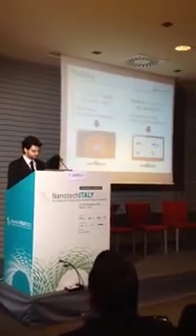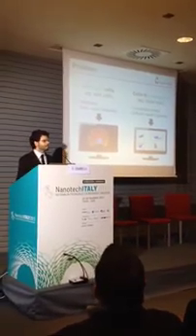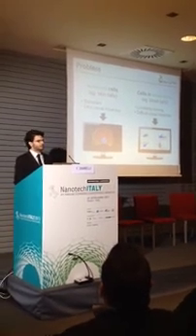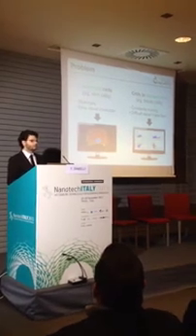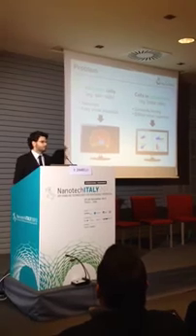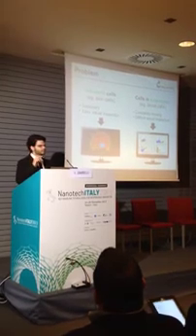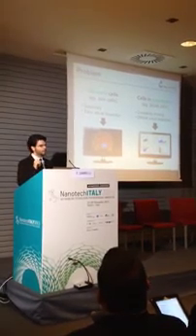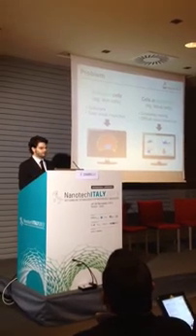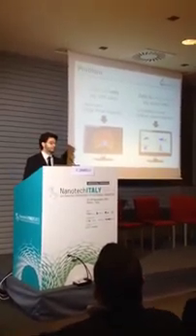Let me explain. Cells can be divided into two categories: adherent cells and cells in suspension. Adherent cells are stationary, so they're quite easy to observe. Cells in suspension, like blood cells for example, need to float. So they are constantly moving and they become quite difficult to observe with a microscope. Unless of course you want to squeeze them under a cover slip, but that would kind of defeat the purpose of analyzing living cells.